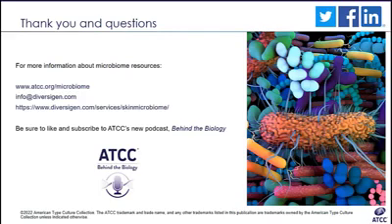So I'm guessing the question is asking to compare 16S amplicon versus shotgun sequencing. In terms of the library prep, this is probably a question more for the wet lab team. But again, a lot of the different biases that I talk about, like low biomass and getting enough microbial DNA, are going to apply to both 16S and shotgun sequencing.